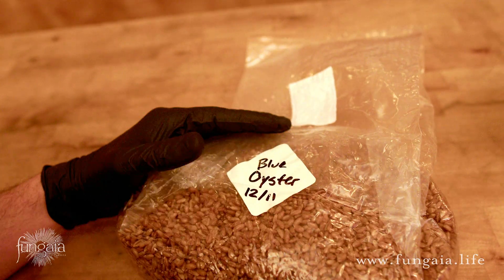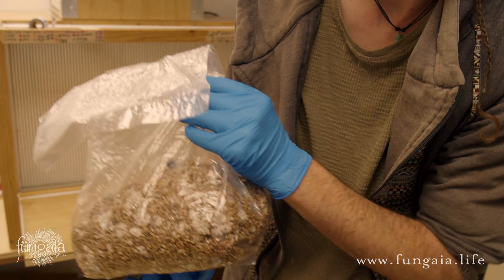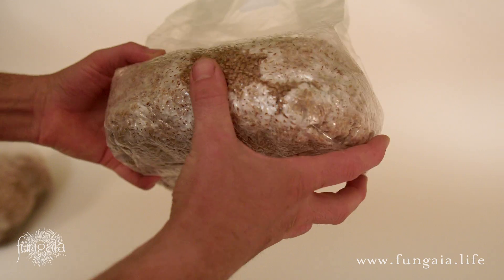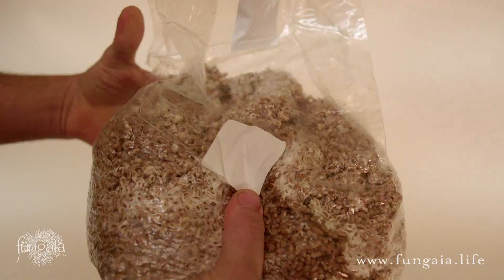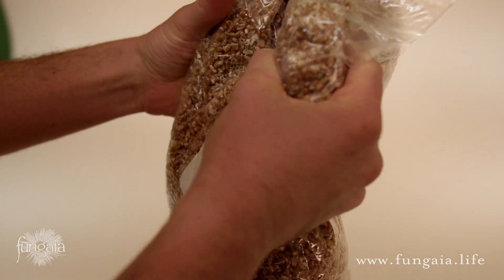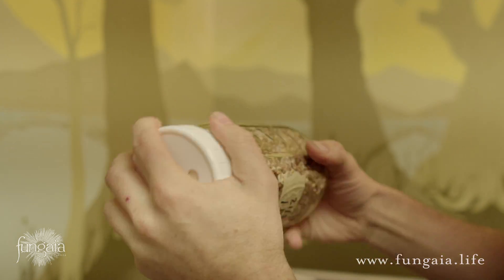Always be sure to label your grain spawn with the species name and inoculation date. Then incubate it in a warm place away from direct sunlight, and watch as a few tiny cells become a mighty fungus in just a matter of days. After a week or two of growth, you may notice large, untouched patches of grain. You can break up and mix the mycelium to speed up the process and get full, even growth. However, this is disturbing to the fungus, so it's best to avoid doing it more than once if you can. Break up the grain by knocking the jar against your palm or a stack of books, then mix it the same way — twisting and rocking.